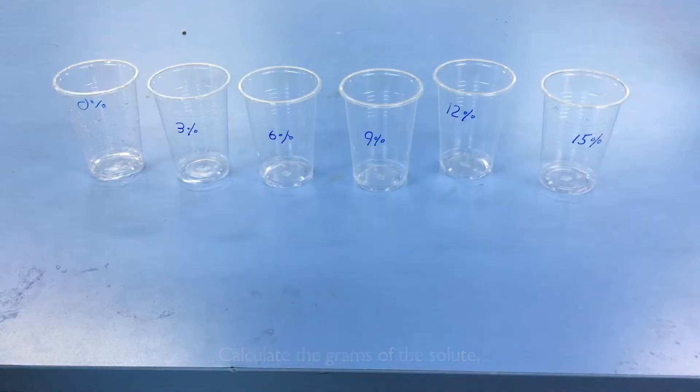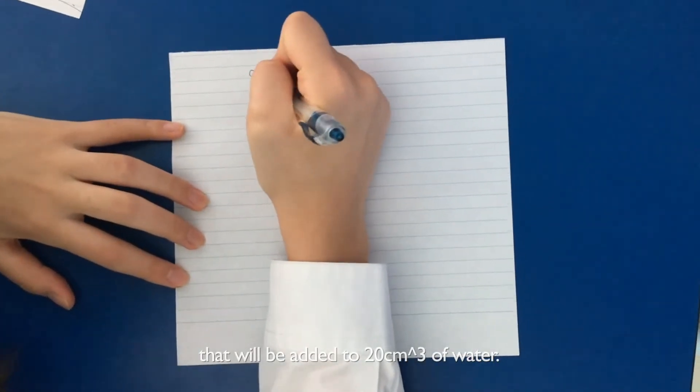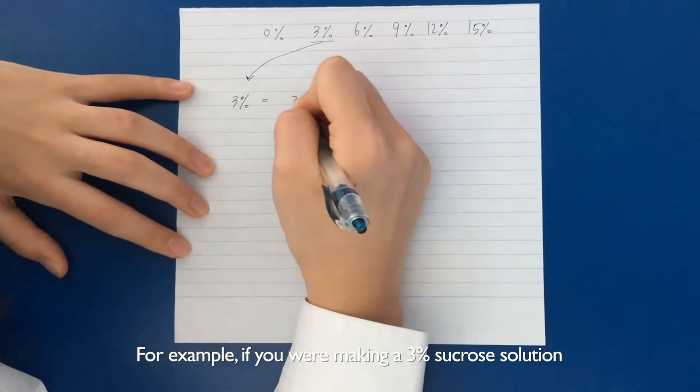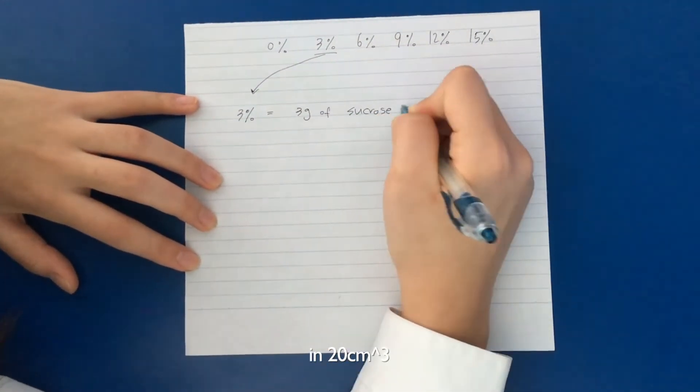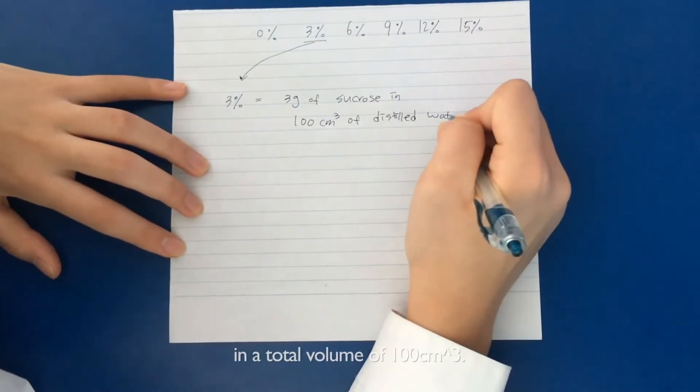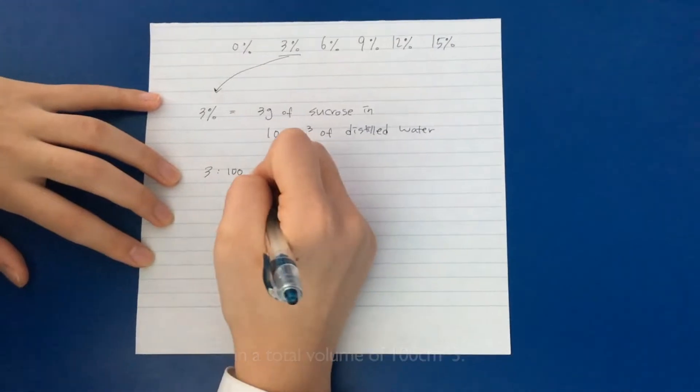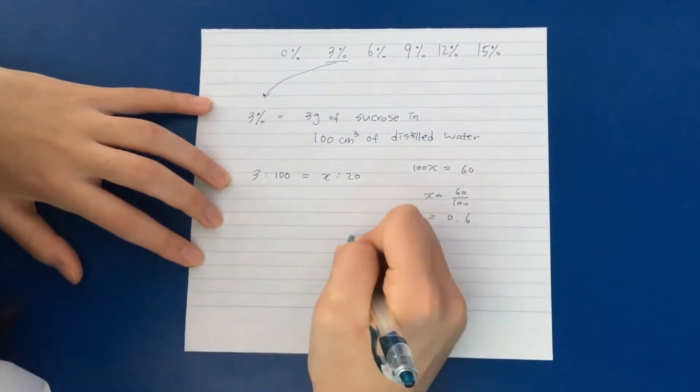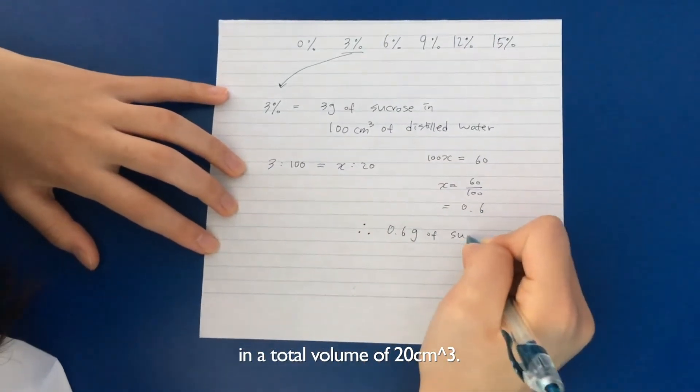Calculate the grams of solute, in this case sucrose, that will be added to the 20 cubic centimeters of water. For example, if we were making a 3% sucrose solution in 20 cubic centimeters, we would think 3 grams of sucrose in a total volume of 100 cubic centimeters. Therefore, in this case, we would only need 0.6 grams of sucrose in a total volume of 20 cubic centimeters.